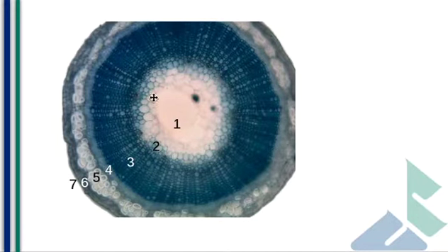The pith is in the middle, the region indicated with the 1. From there, we see the startings of very thick cell walls, colored in a much darker blue here. These are our protoxylem, our early developing xylem. After that, we have our true xylem of the plant, lots and lots of tubes for water transport. You can see that that makes up a huge portion of this plant stem.